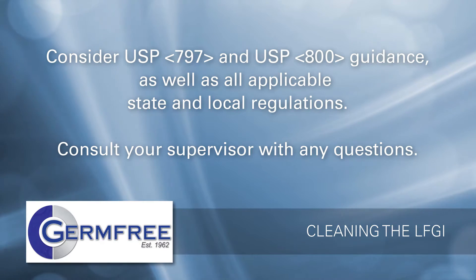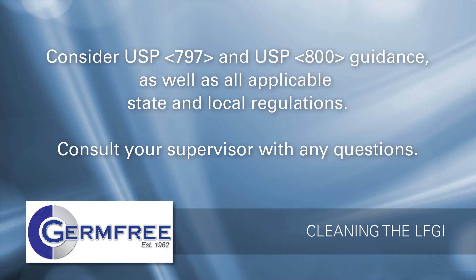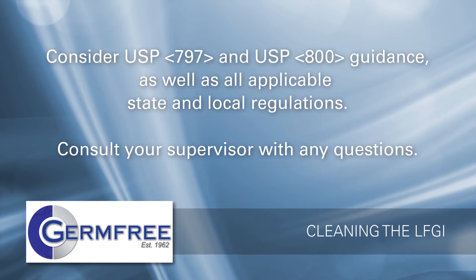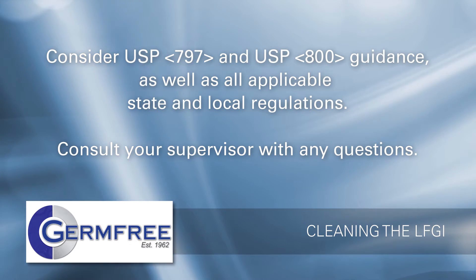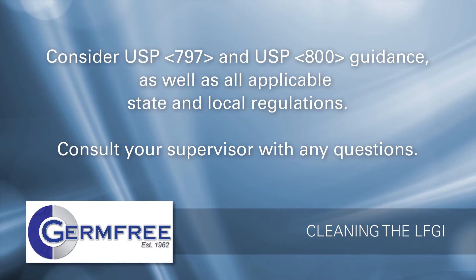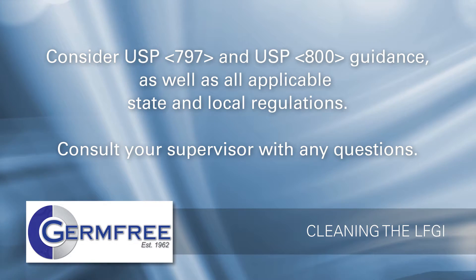Your organization's cleaning and disinfection requirements may require work practices that are different than the general guidance in this video. Germ-free recommends considering USP 797 and USP 800 guidance, as well as all applicable state and local regulations. Consult your supervisor with any questions you may have.